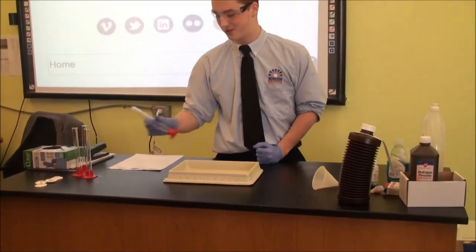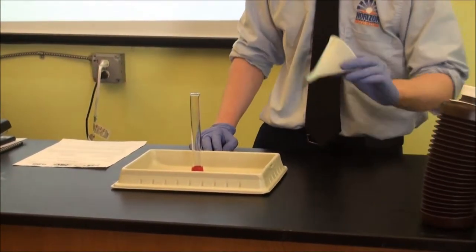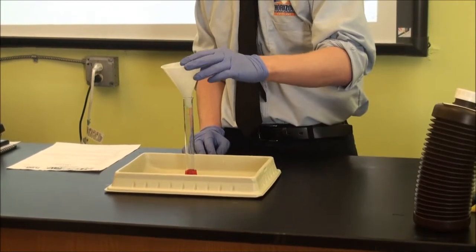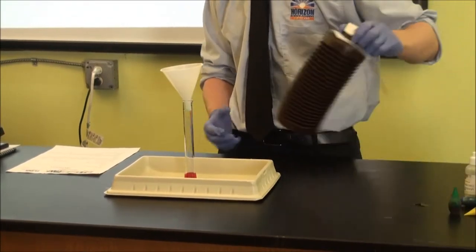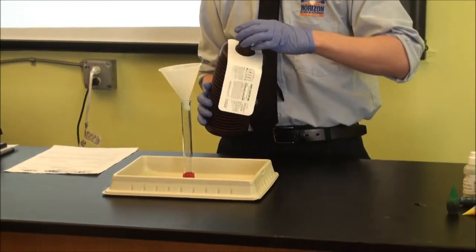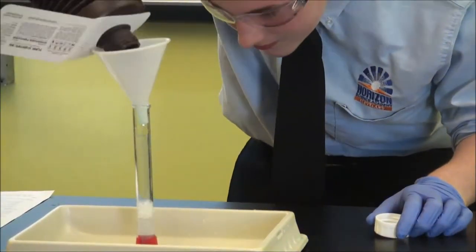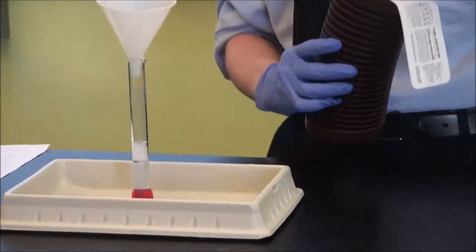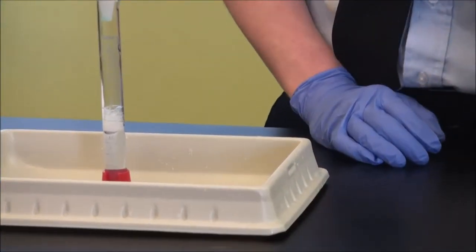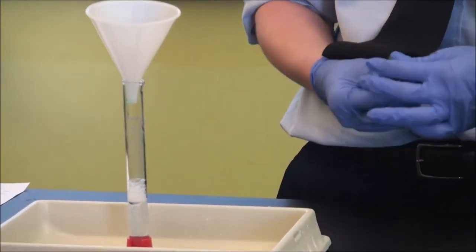We start off with our cylinder and we can use our funnel to pour 10 milliliters of hydrogen peroxide, and then put the food coloring in as much as you like.